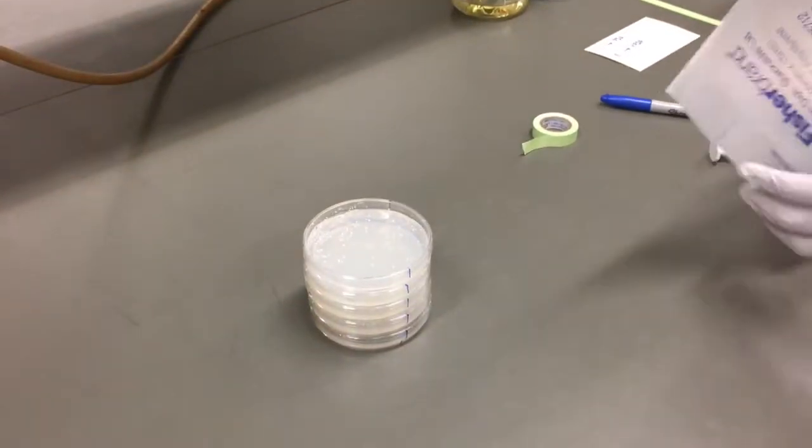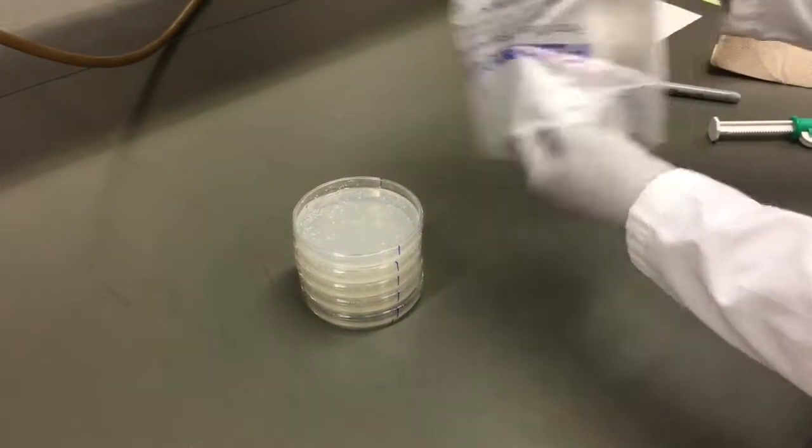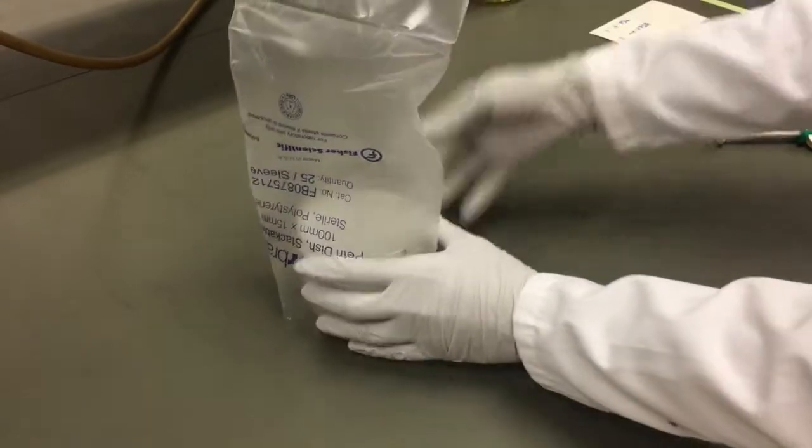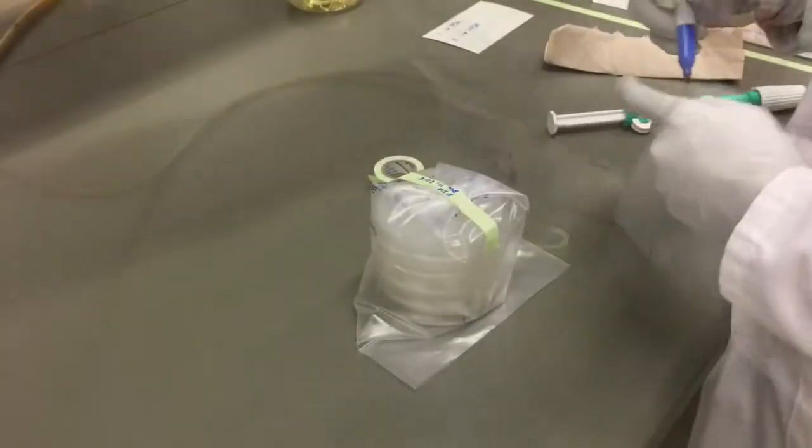Once plates have solidified, mark the edges of the plates with a color specific to your media type instead of having to label the bottom of each dish. Return the plates to the original bag, being sure to slip the bag over top, do not slip your arm into the bag. Label the bag with the media type and date prepared.